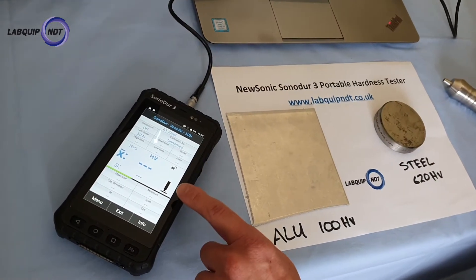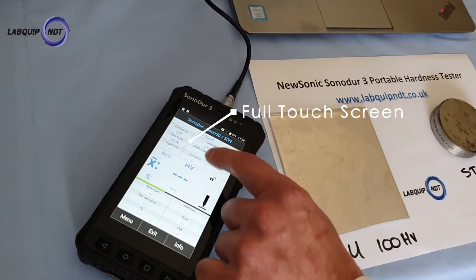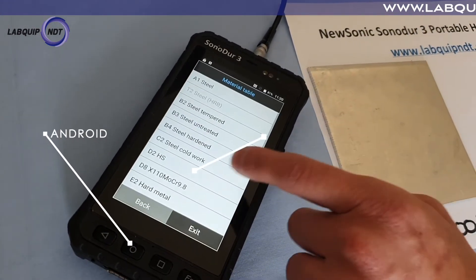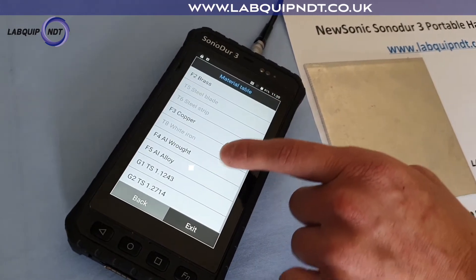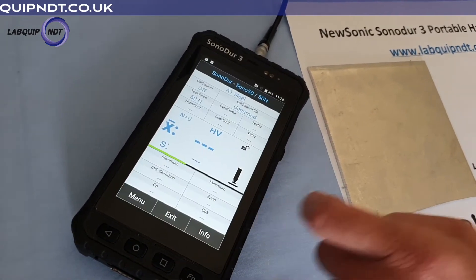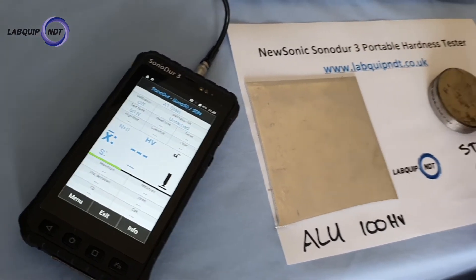We've got a full touchscreen when you turn on the Sonidor 3, and that's the main difference. It runs on Android. We've also got multiple different pre-loaded library of materials — aluminium, nickel, steel — and today we're testing some carbon steel here on the test block.